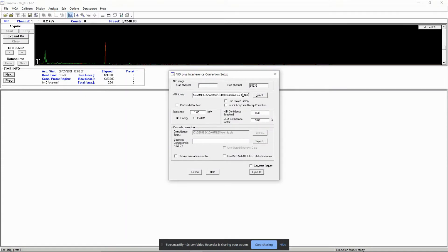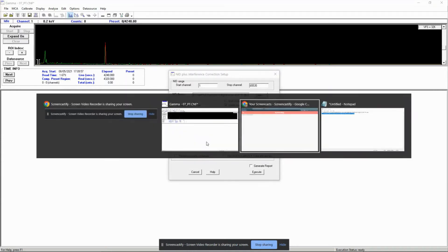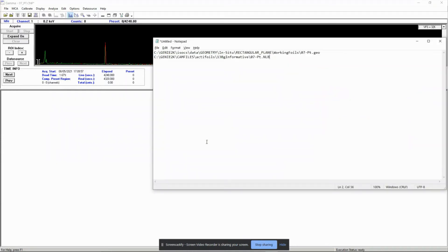Step four, final step: nuclide identification using NID with interference correction.